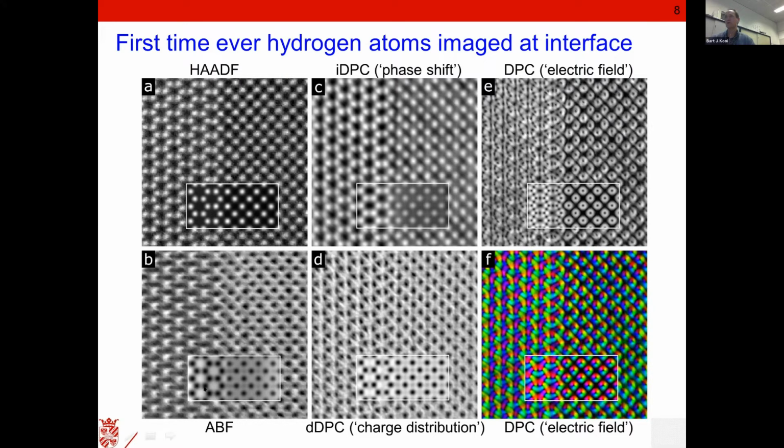Yeah. And then you can say, okay, maybe there is filtering here. No, the signal in the end is identical, and all the images have been filtered in the best possible, identical ways. And then here we have this special way, this is called integrated differential phase contrast. And actually it's most close, that is the phase shift caused by the specimen, that is what we image.